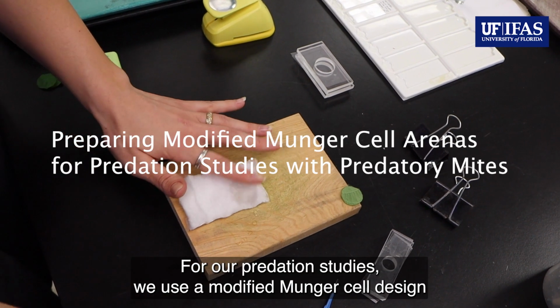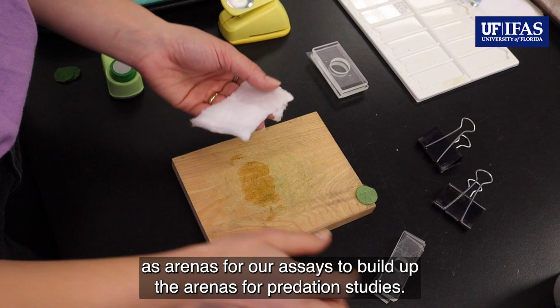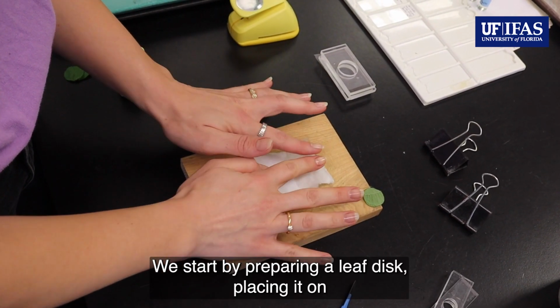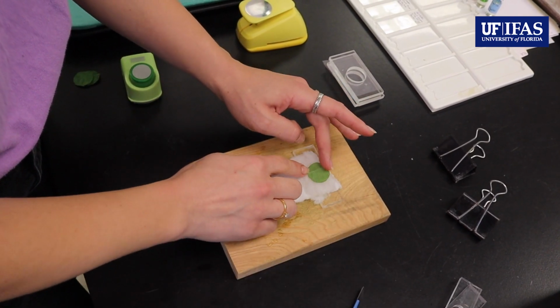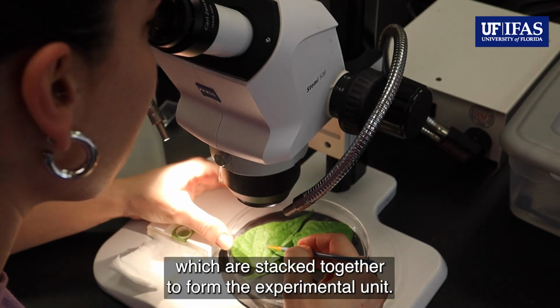For our predation studies, we use a modified Munger cell design as arenas for our assays. To build up the arenas, we start by preparing a leaf disc, placing it on wet cotton to keep the leaf healthy and maintain moisture. Then, we use acrylic slides, which are stacked together to form the experimental unit.